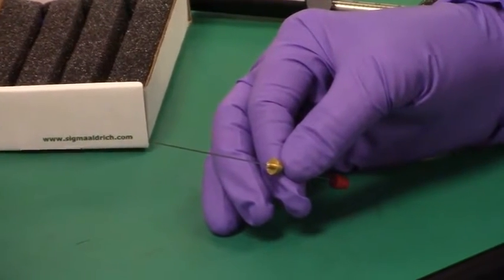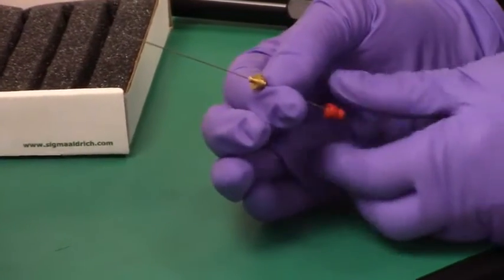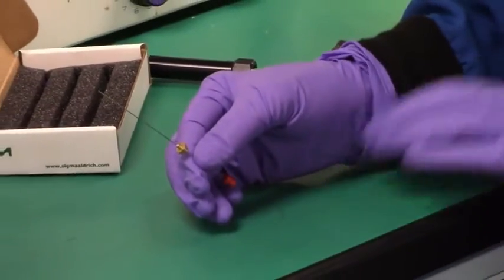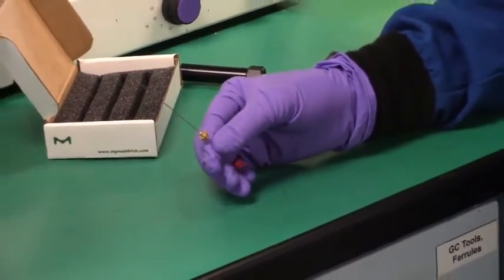It doesn't require any solvent, and the best part is these fibers are reusable. So it is very inexpensive. It's not like SPE where once you use the cartridge you throw it away.